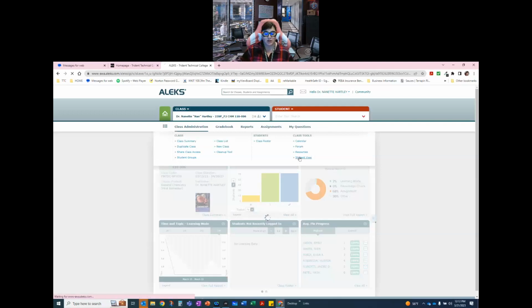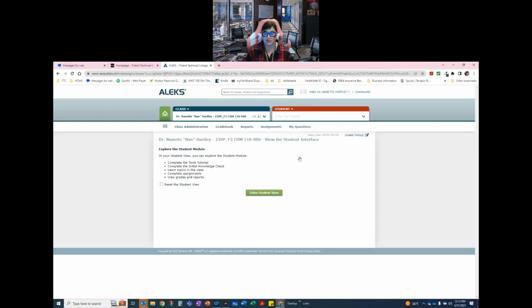So, dealing with measuring by difference, dealing with measurement of volume by water displacement, which of course is a very famous way to do this. All of that should be stuff that you need to see.